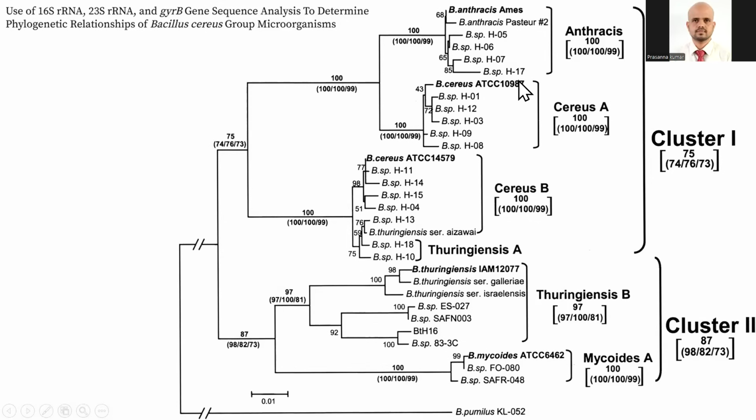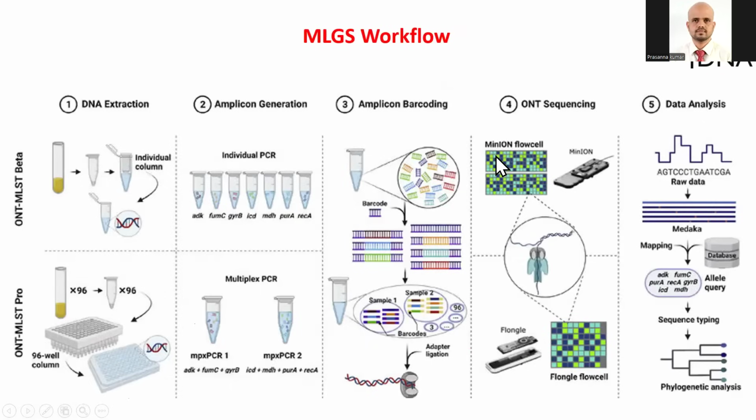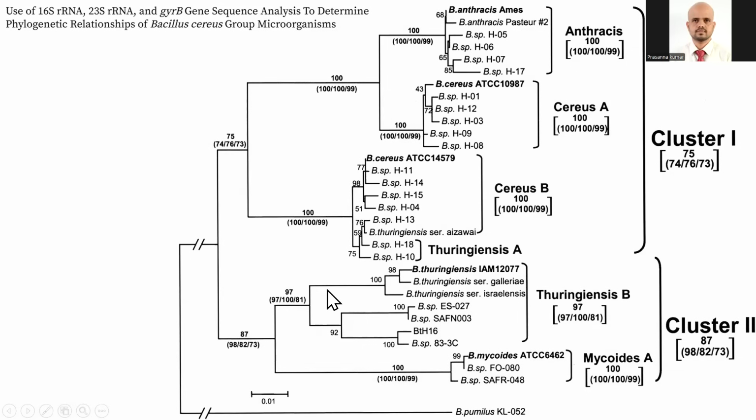All right. So when sequences are in the same branch, it means they are more similar. For example, here Bacillus cereus branched with all other species, so they may all belong to the same species. Here Bacillus mycoides is kept away from Bacillus cereus. If you want to reach Bacillus mycoides, you need to track along this and then reach Bacillus mycoides. So they are kept away, meaning they have more variation when compared to the DNA sequence of Bacillus cereus. So phylograms are graphical representations of similarities and variation among DNA sequences.